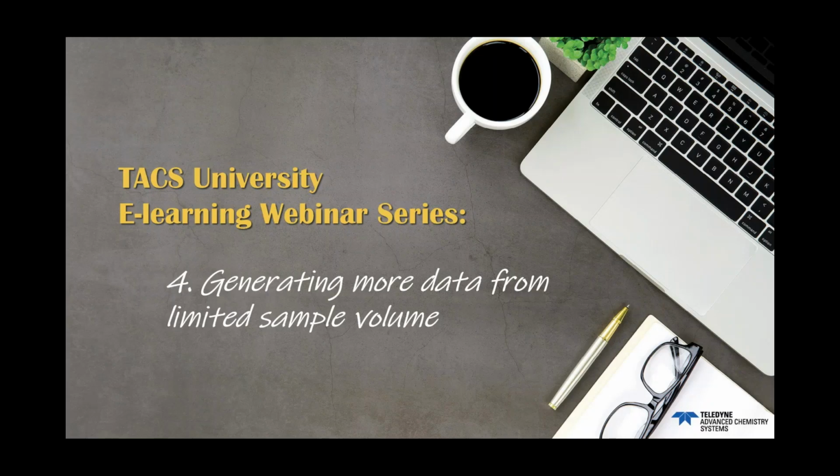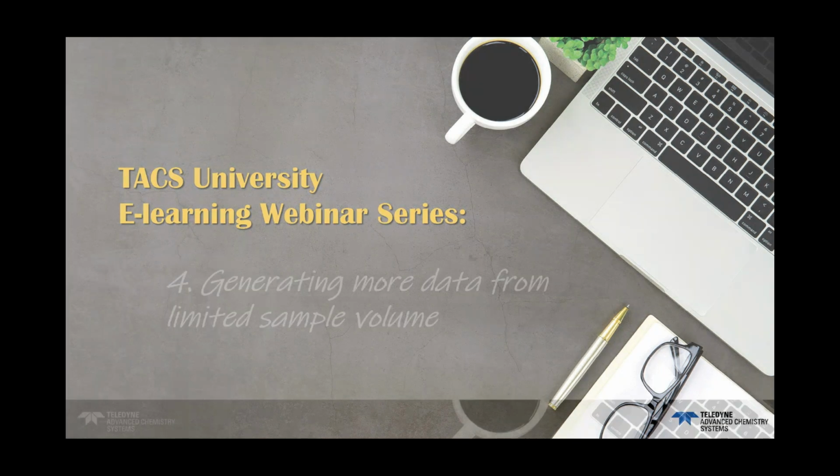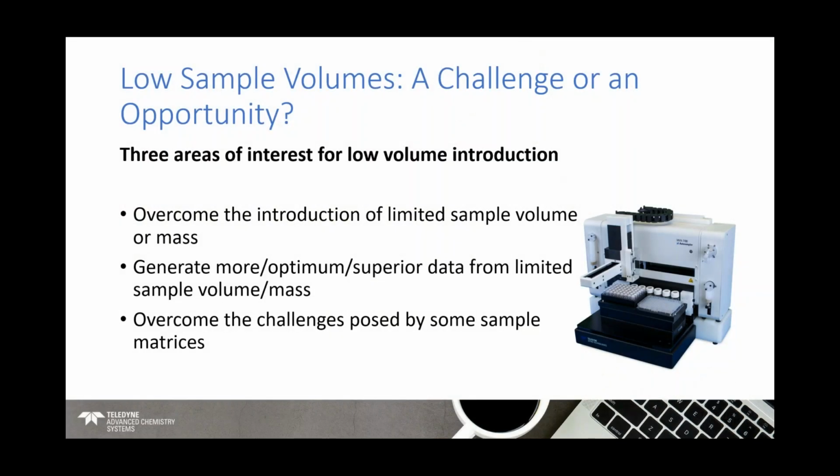The next section I'm going to move on to is the idea of generating more data from a limited amount of sample. We developed this system primarily to overcome the problem of having a limited amount of sample volume, or a very small mass of sample that could be digested.